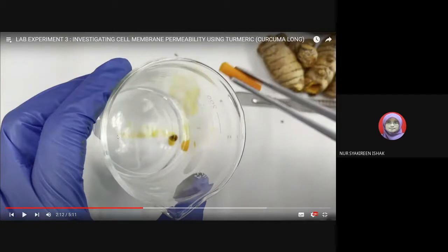Okay, so the purpose of immersing this turmeric in the distilled water first is so that when you prepare the turmeric cylinder using the cork borer in the first procedure, you are going to damage the cells of the turmeric on the outside here. The damaged cells will release the pigment from the cell. So that's why you need to immerse the turmeric inside distilled water first, so that the pigment on the damaged cells will be released first into the distilled water.